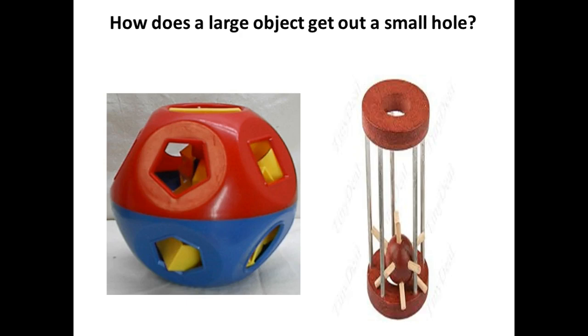So this is very similar to what happens, and why that iodine step is so important. Crystal violet goes in, just like the block goes in, right? Then the iodine goes in, just like the hand goes in, and the two combine. So now they're larger, and so it's harder to get them out. And then, for gram staining, what also happens to that hole when you decolorize? It shrinks. Can you imagine sticking your hand in and the hole shrinking up on you? You'd really have a screaming kid, right? So the first time this happens, you've got to convince the kid to drop the block out of their cute little hand so you can get their little hand back out the hole, and teach them how to open it, so that they can get the blocks out and do it again.